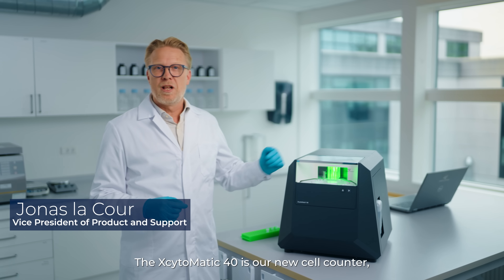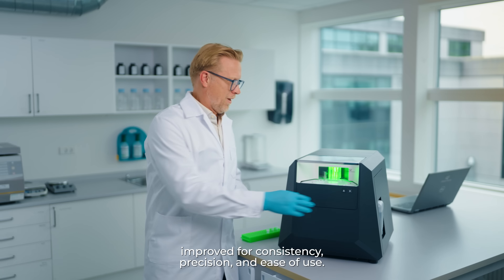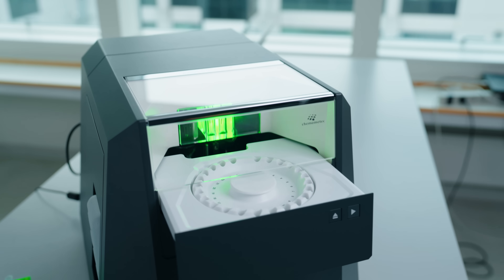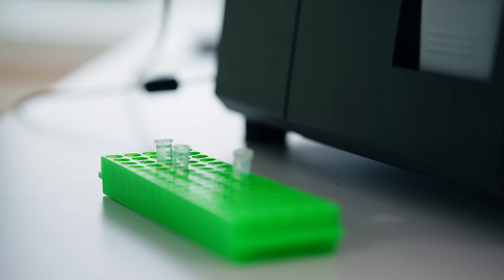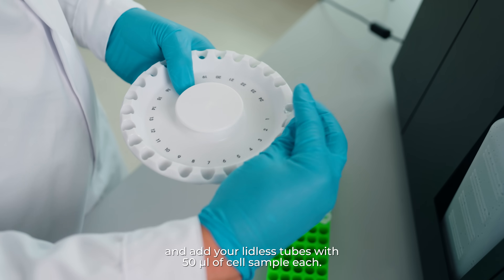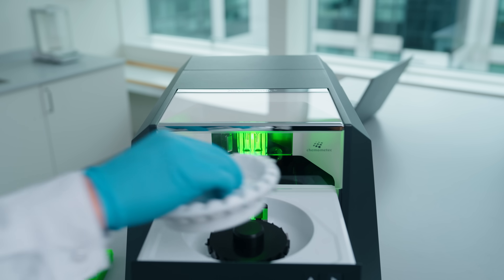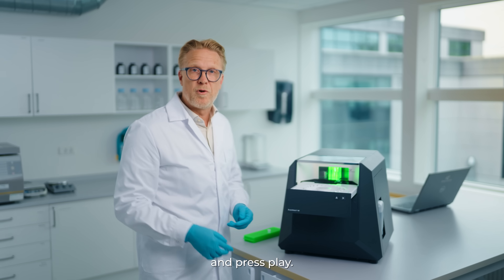The Excitomatic 40 is our new cell counter improved for consistency, precision and ease of use. Just take out the carousel, add your tubes with the cell sample — 50 microliters in each tube — put in the carousel and press play.